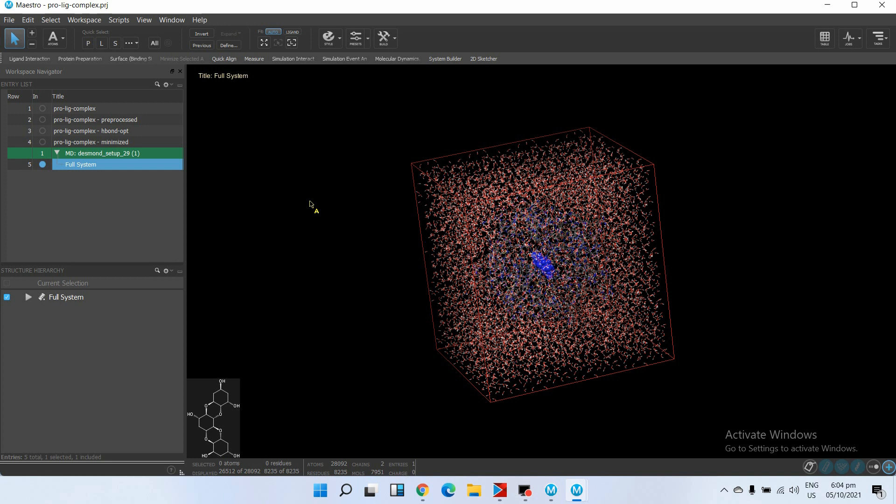In the next step we will run this simulation on our Linux operating system. We'll select the parameters, then we will go for the simulation, and then we will analyze the results. Thank you very much for your time.